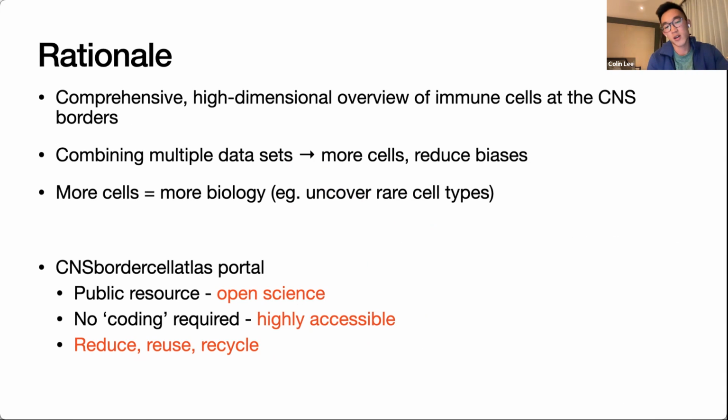The CNS Border Cell Atlas portal is meant to be a public resource in the spirit of open science. There's absolutely no coding required, so it's highly accessible. And in the spirit of sustainability, it's meant to reduce, reuse, and recycle these very costly experiments that have been put into curating all of these data sets.